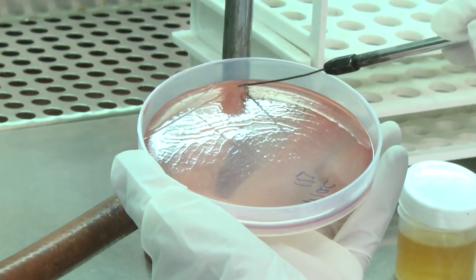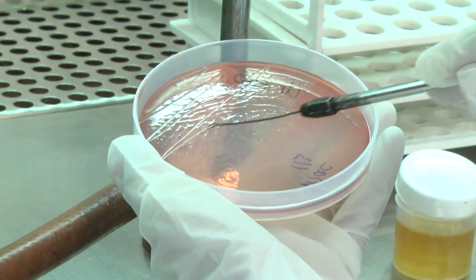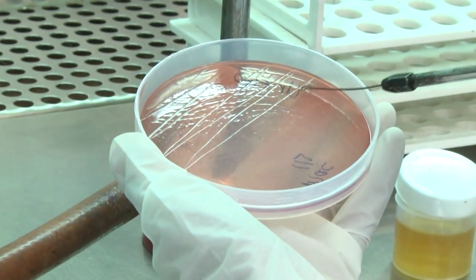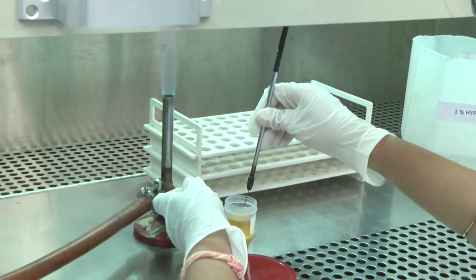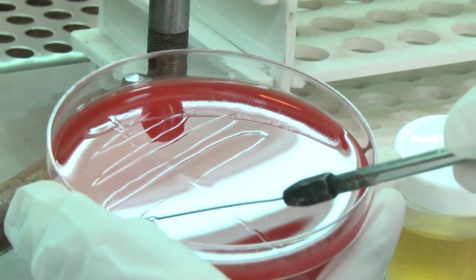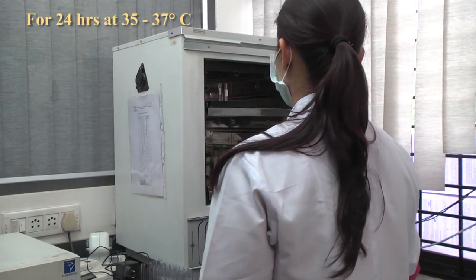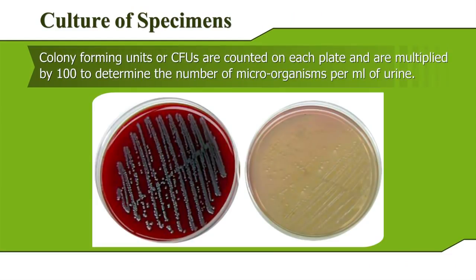Then, starting from one end of the line, spread the inoculum in a zig-zag fashion across the middle line, covering an adequate portion of the surface of the agar. Without reflaming, insert the loop vertically into the urine container again and repeat the procedure for the other plate. Incubate plates for 24 hours at 35 to 37 degrees centigrade. Colony forming units (CFUs) are counted on each plate and multiplied by 100 to determine the number of microorganisms per milliliter of urine.